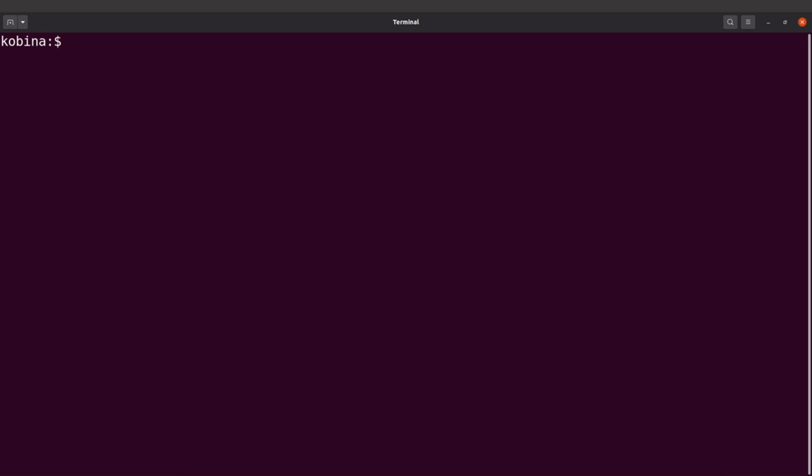Okay, we are on the terminal now. So what we will do first is to create a working directory. So we will say mkdir RNA-seq, and then we are going to cd into it. And so this means that files that we will generate will all be saved in the directory. And it's important we do this because we would like to separate all the files that we are going to generate from files that are already on our PC. Okay, so now we have created it, we have cd'd into it.